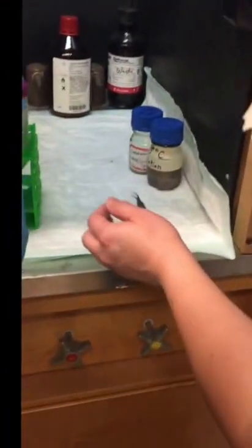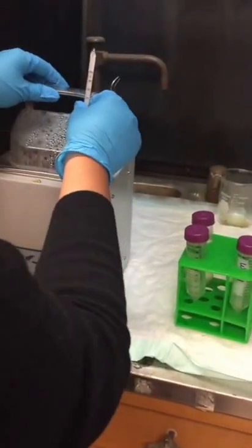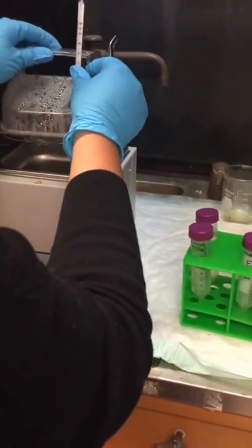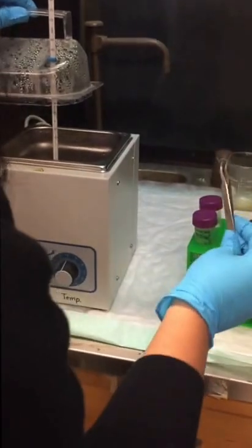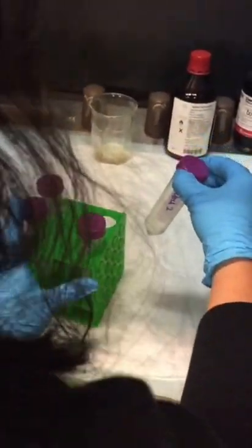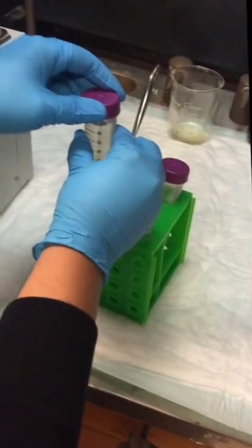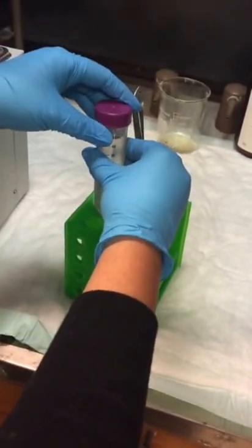We can use that stand in which it was kept. So now we need to transfer it. Wash buffer two is in here and it's heating — it's around 35 degrees or so. It's on the second wash.